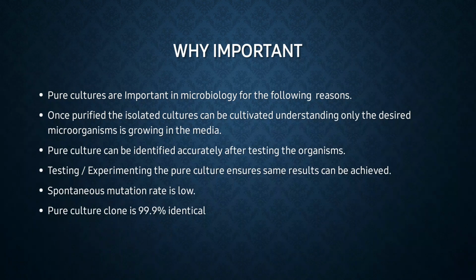Why is this culture technique important? Pure cultures are important in microbiology for the following reasons. One, the purified isolated cultures can be cultivated, containing only the desired microorganisms growing in the media. Two, pure culture can be identified accurately after testing the organism. Three, spontaneous mutation rate will be low and the same results can be ensured, and it will be 99.9% identical.